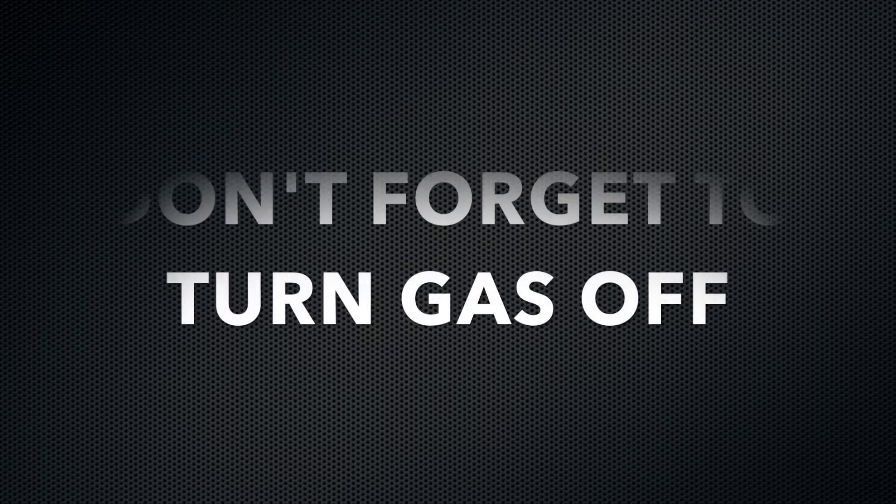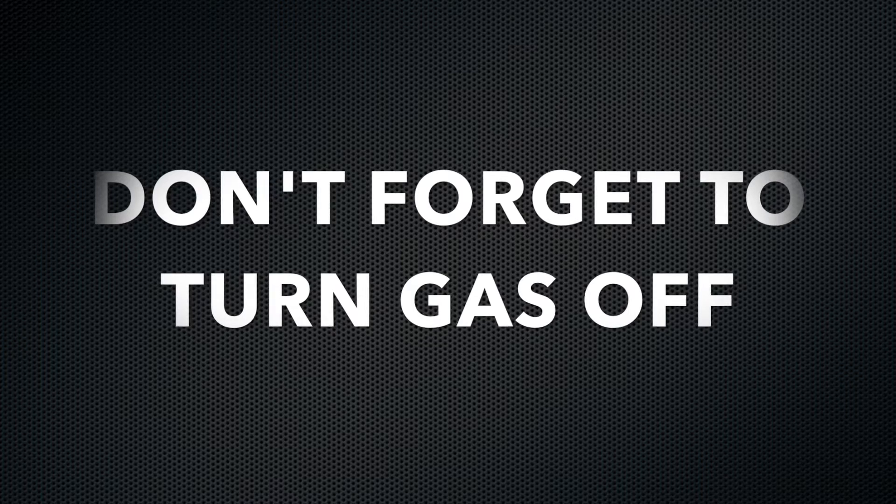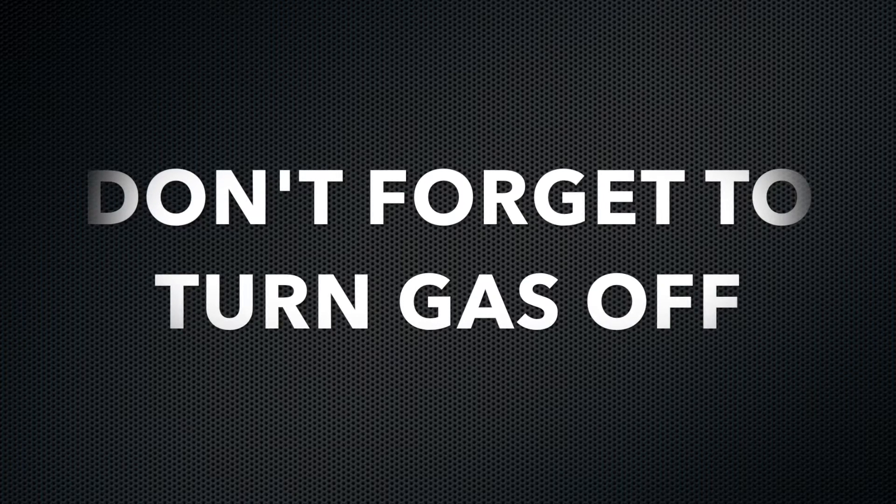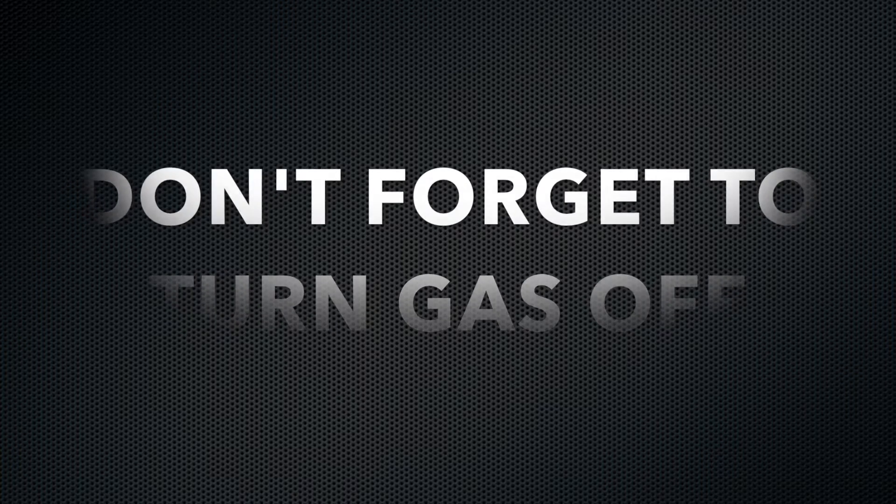Also remember when you turn off the flame to turn it off at the gas valve, not by blowing it out. This is to avoid having excess gas leak into the lab room.